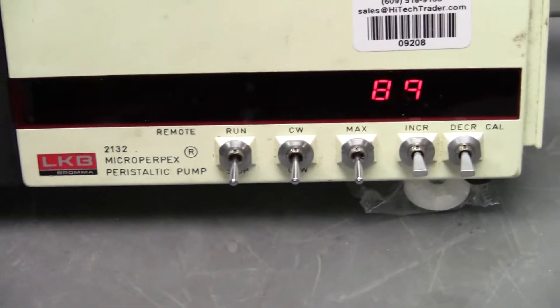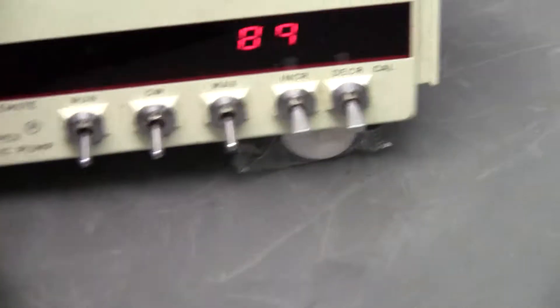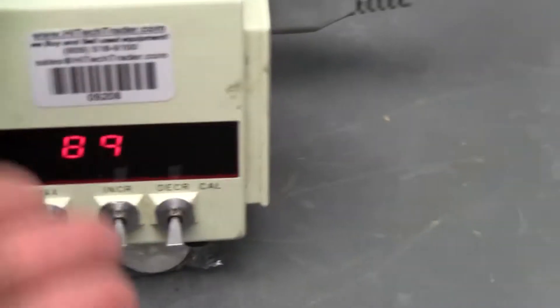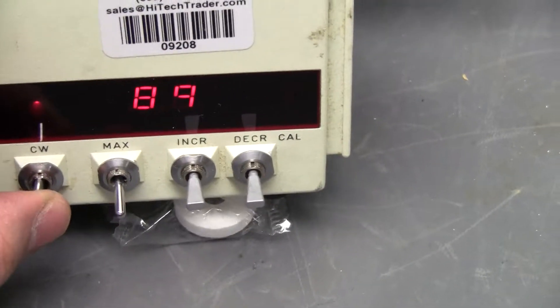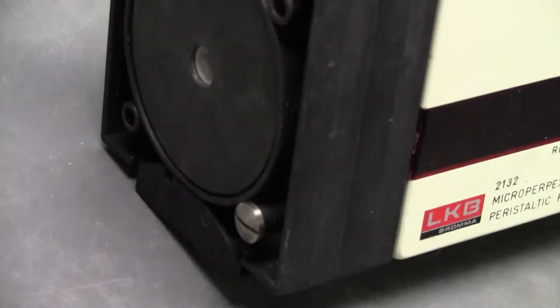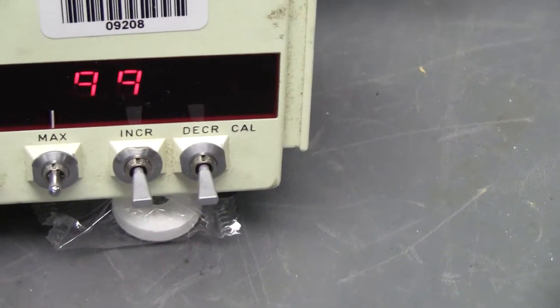We went through and put on some new switches for you. We have the run switch, and everything works in the up position. Your second switch is your counterclockwise that changes your motion. I'm going to flip that back so you can see that go the other way. Your max switch — if you hold it up, it will go to the maximum RPMs.